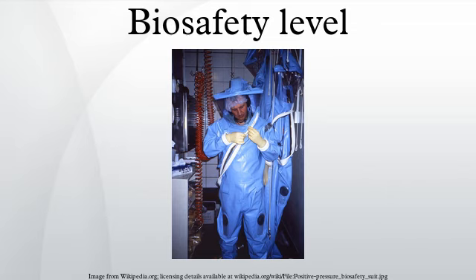Rationale: biocontainment can be classified by the relative danger to the surrounding environment as biological safety levels. As of 2006, there are 4 safety levels. These are called BSL-1 through BSL-4, with one anomalous level, BSL-3-Ag, for agricultural hazards between BSL-3 and BSL-4. Facilities with these designations are also sometimes given as P1 through P4, as in the term P3 laboratory. Higher numbers indicate a greater risk to the external environment.